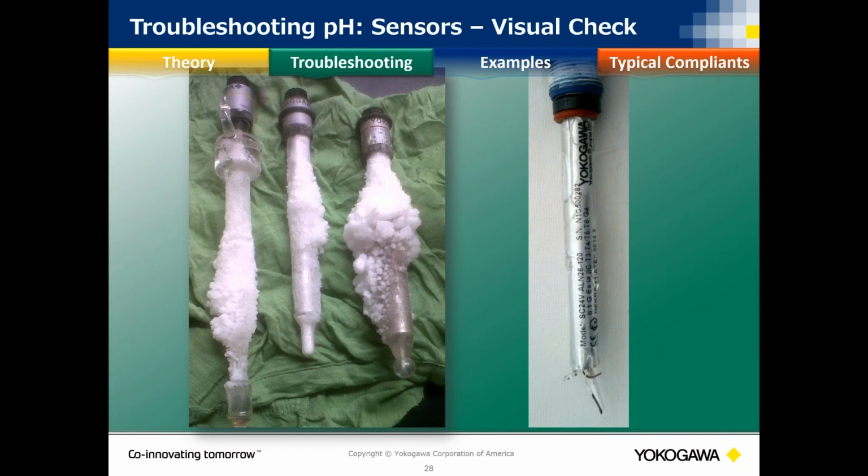They didn't want them. This is a picture of literally a set of probes inside of a salt bath where they turned off all the alarms, and it was still reading because you can see the glass electrodes were just fine, but when we physically went to take it out of the process, that much salt was built up on the actual probes. So eventually their pH reading started to drift, and it was simply because of coating. So leave those alarms on your analyzer that the manufacturers have that give you indication on coating ingress, okay? That can help you know when you've got to clean it before it's failed.